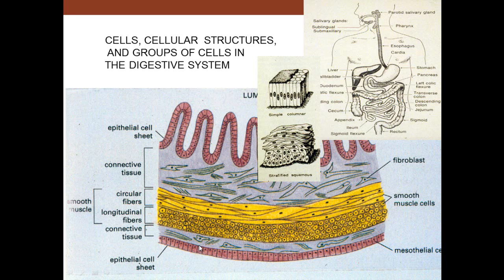In contrast, at the other side of the tube, there is another type of epithelium. We call it mesothelium, and that's simple cuboidal. Sometimes it looks kind of squamous too, but it's simple cuboidal cells located through there. In addition to that, there's muscle. There's muscularis externa that we see there, and there's connective tissue. And in connective tissue, of course, you have blood vessels, nerves, and the immune cells would be located in there as well.